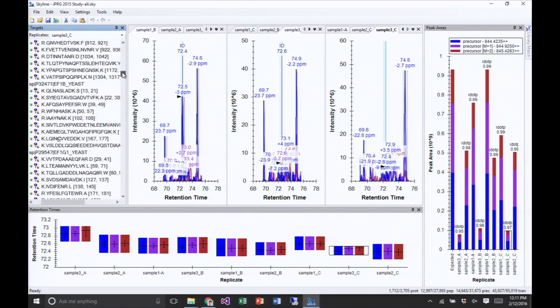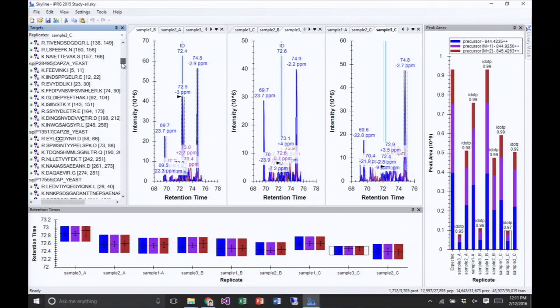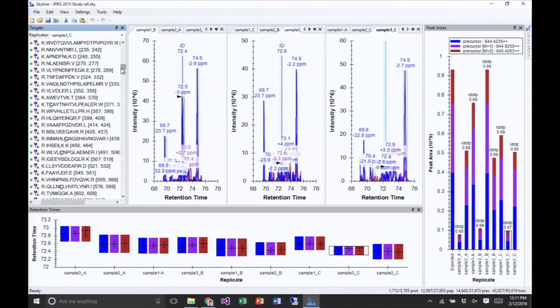Yeah. Okay. So let's follow my own good advice of doing some logical checking, or just some initial checking of the data, whether we're going to be getting good peak areas out of this. So the first thing I said is these IDs should show up. So they're showing up. That's a good thing.